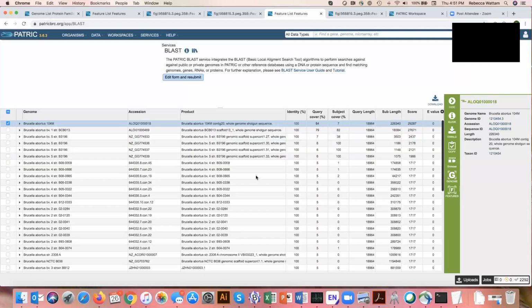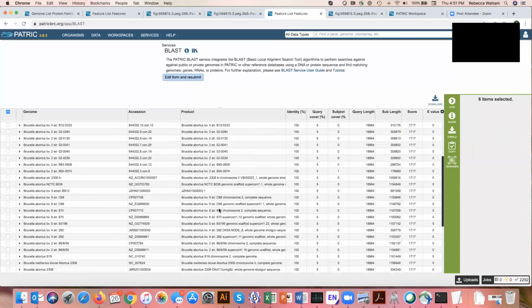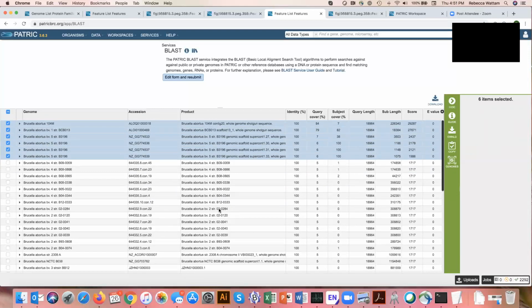So I would still argue that I would trust this and this, and even these little pieces, even though they're small. But when it gets to this, it's just terrible. So it's probably just pieces of the chromosome that are conserved across that. It's nothing like what we would expect to see with a good, strong identity, especially if it's only 5%.